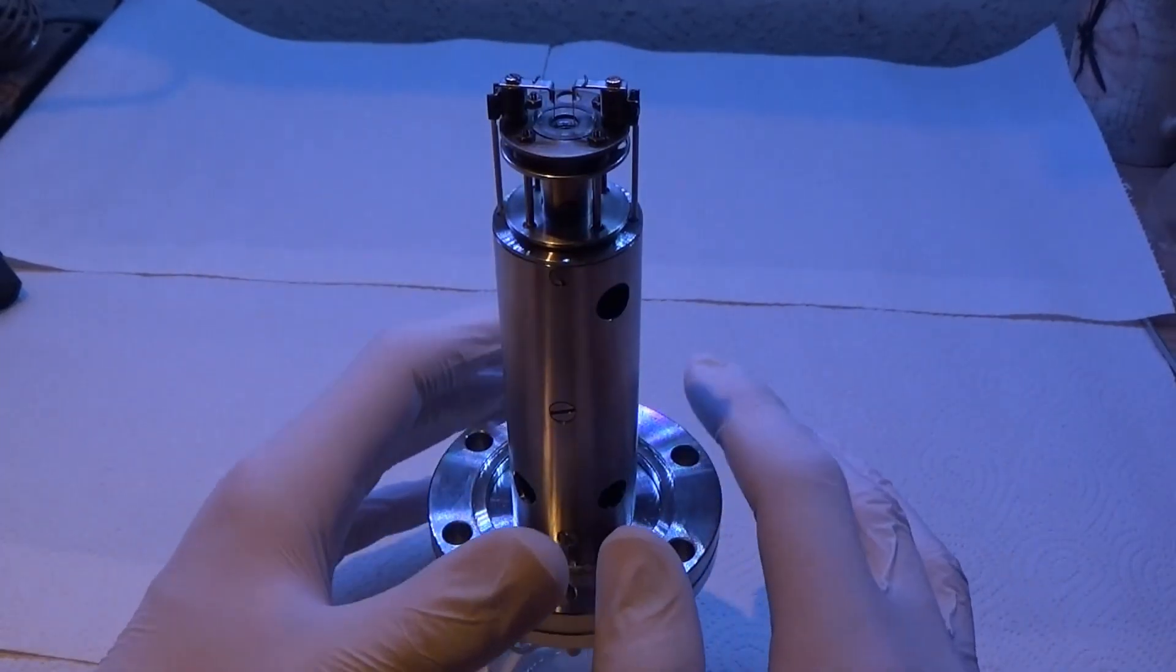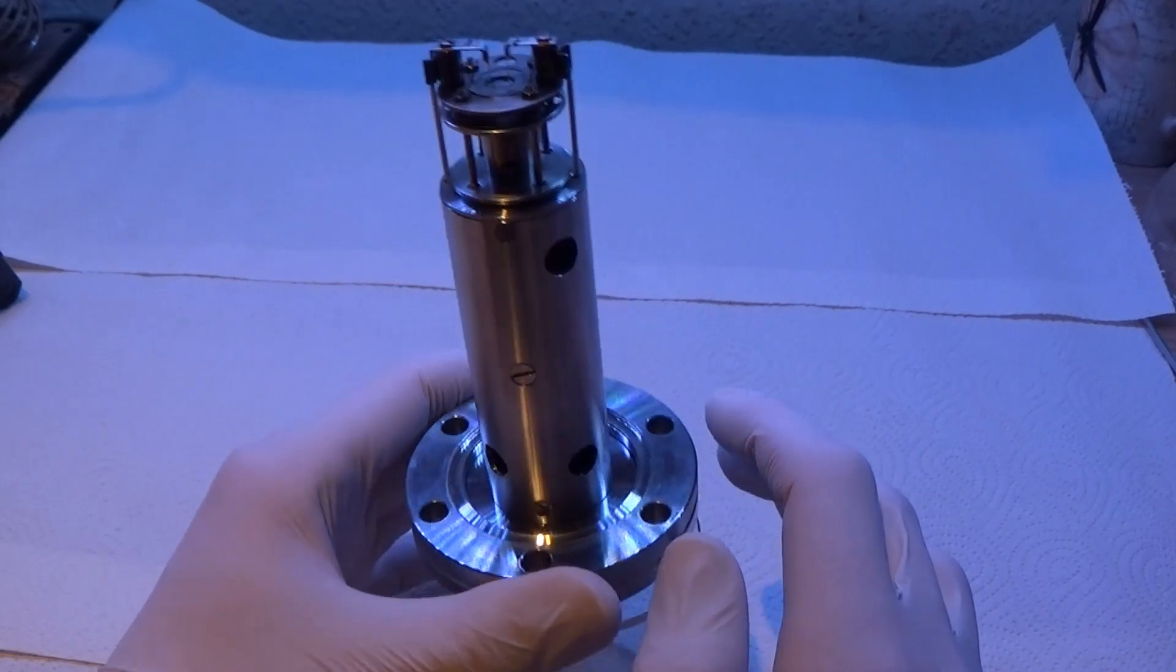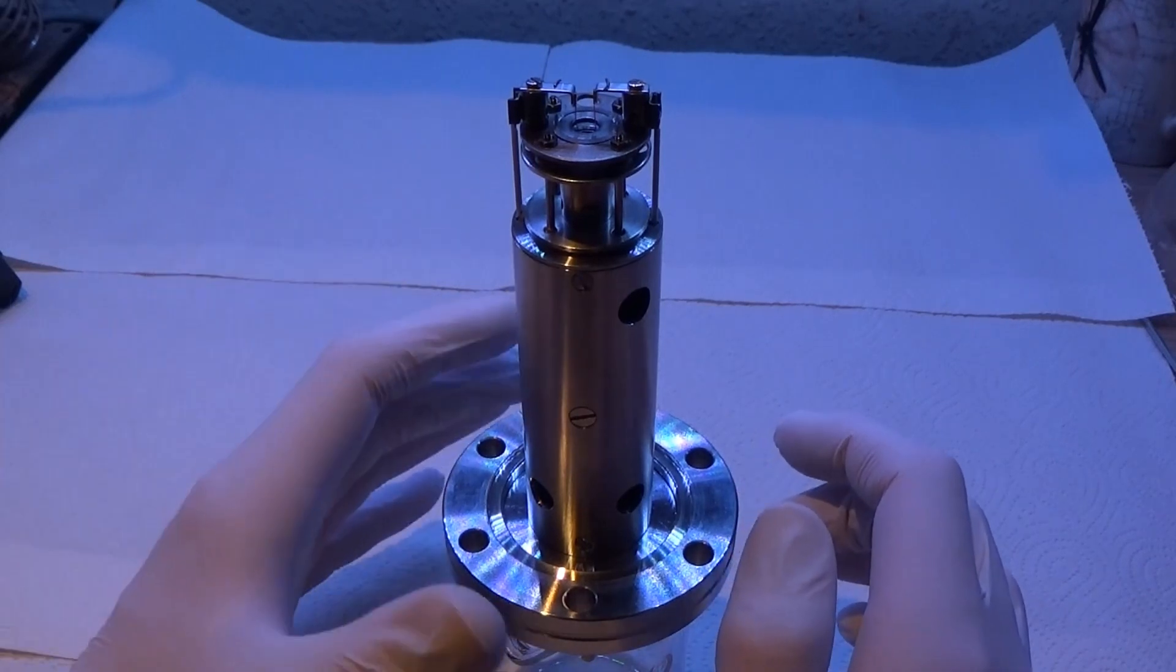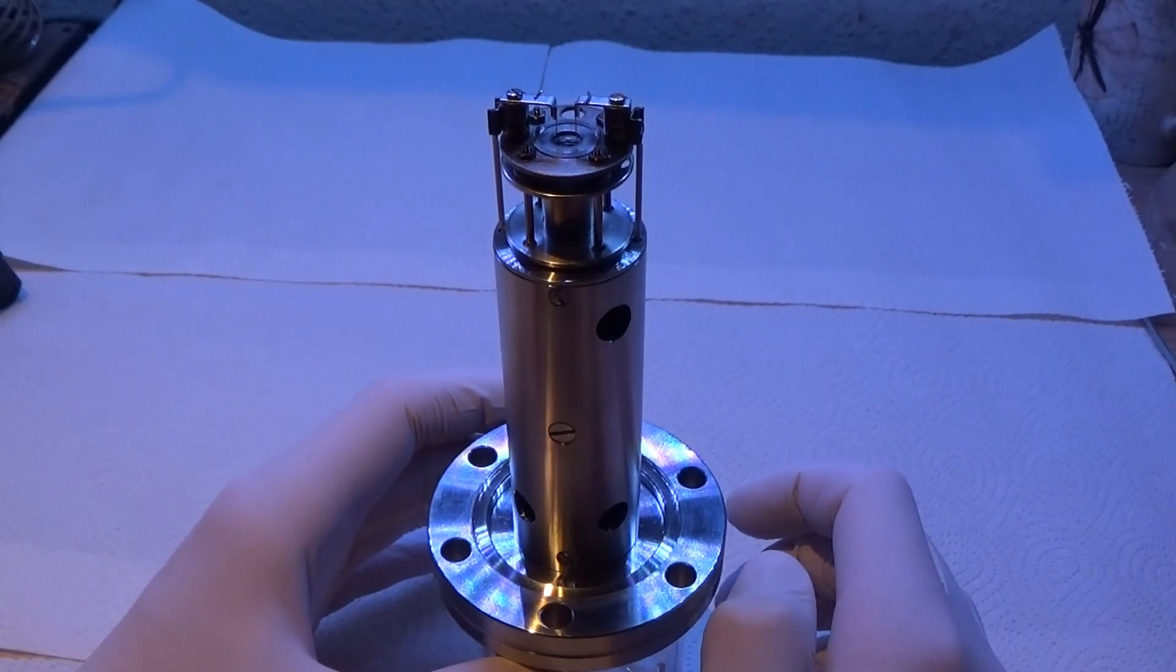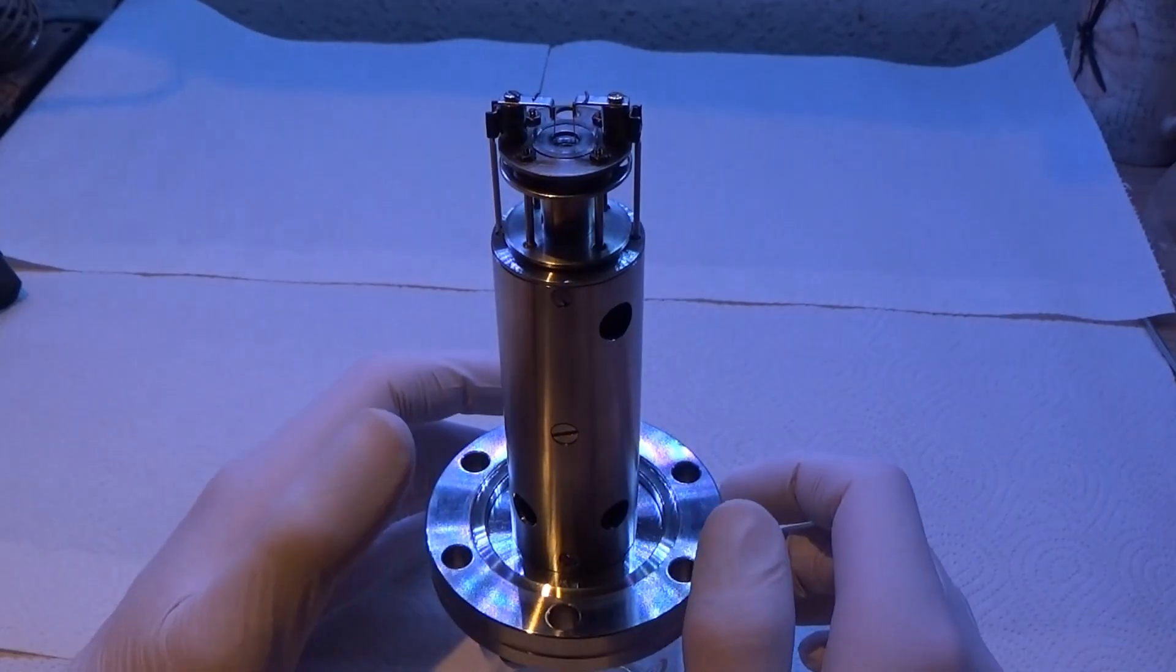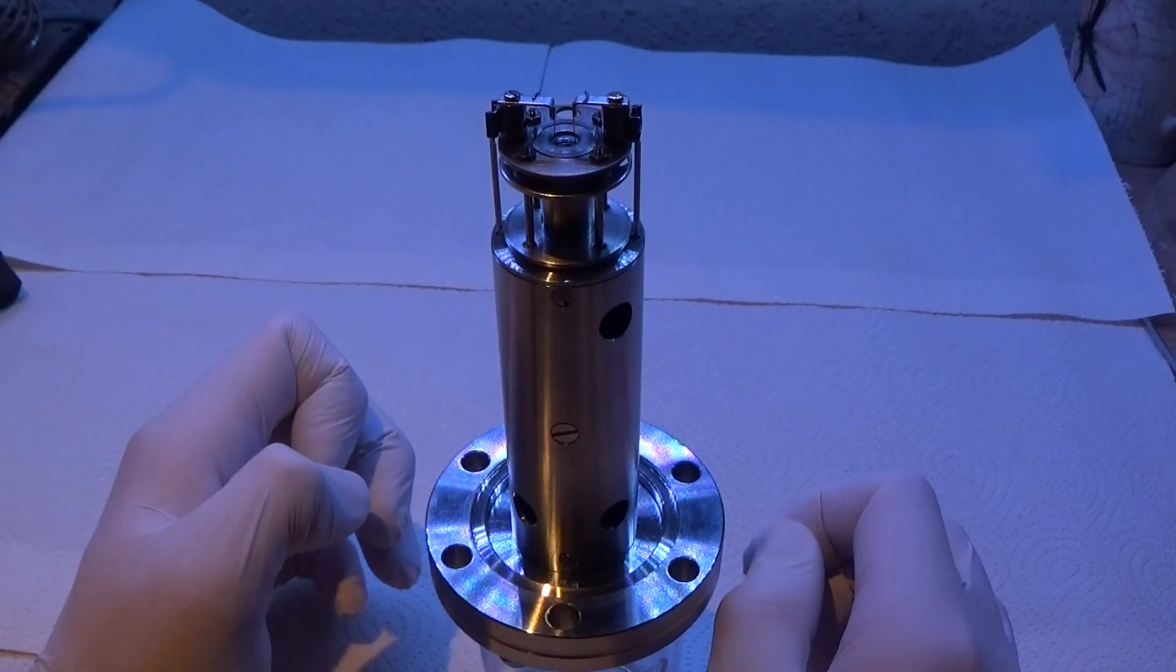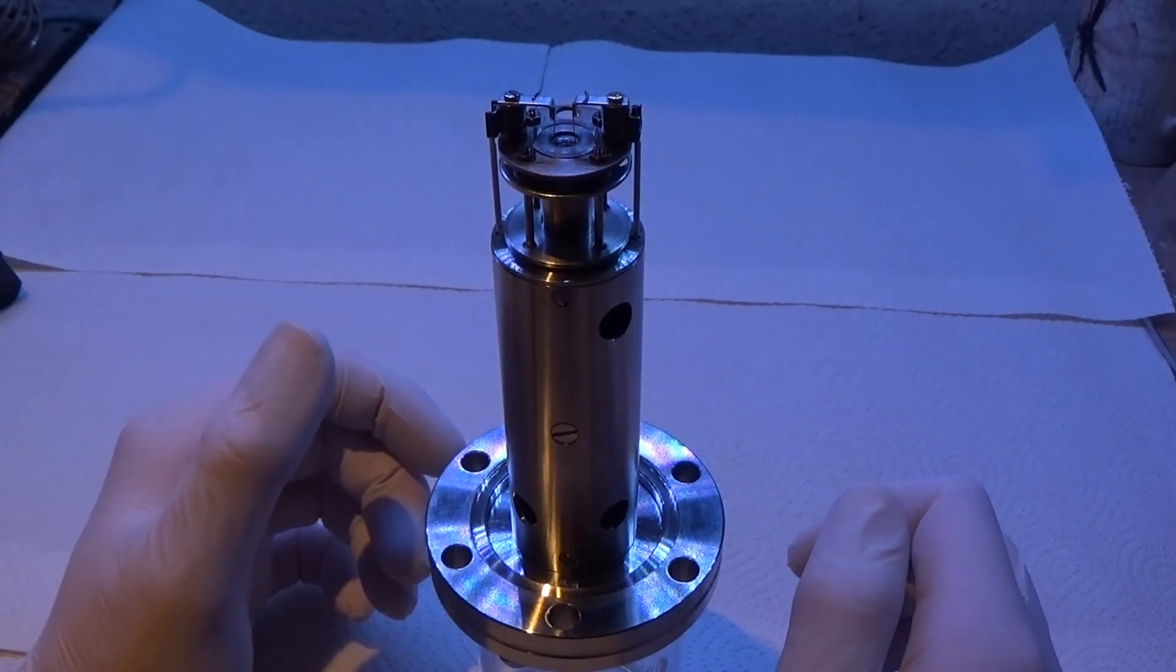They are usually characterized also by having quite a limited mass range. I think the biggest one has a mass range of about 0 to 300 AMU. This one, this tiny baby one, and it really is smaller than a beer can, has a mass range of 0 to 60 AMU. If you are a chemist, you will think that is extremely pointless. But it is actually pretty smart, especially if you are doing analysis on permanent gases, because most permanent gases will have a mass lower than that. The original reason why you would want a higher mass range for residual gas analysis is to be able to also detect mercury. Of course, old vacuum systems would use mercury diffusion pumps and also different kinds of mercury manometers.